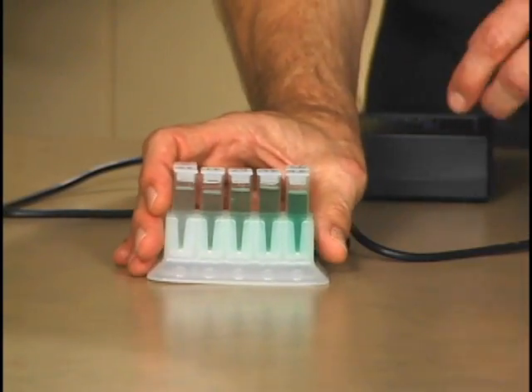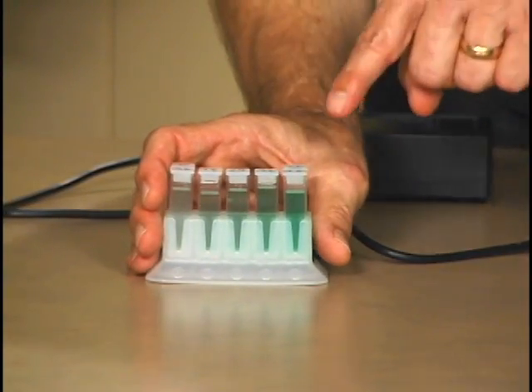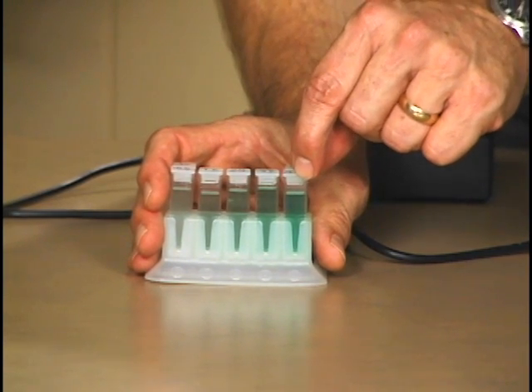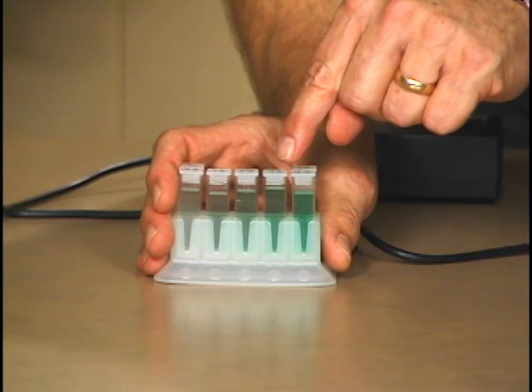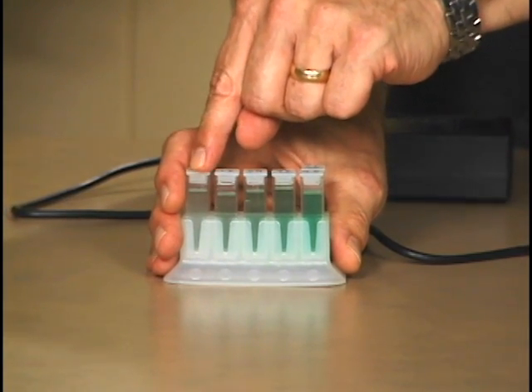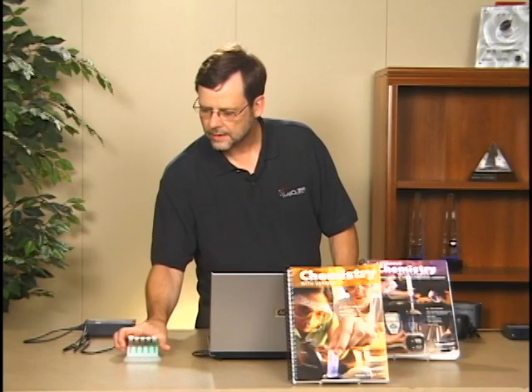The students would have already prepared the standard solutions, starting with a 0.40 molar solution. They would have done a series of dilutions by four-fifths, three-fifths, two-fifths, and one-fifth, respectively. So a student would have already done that particular step.